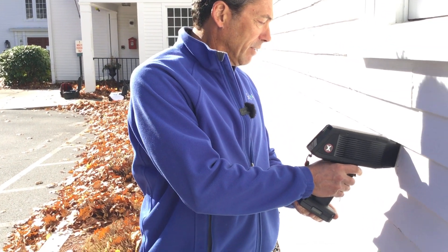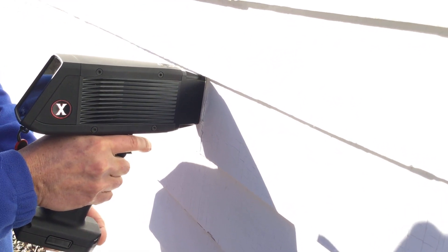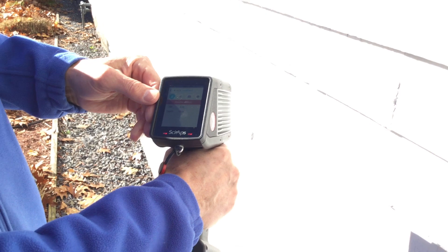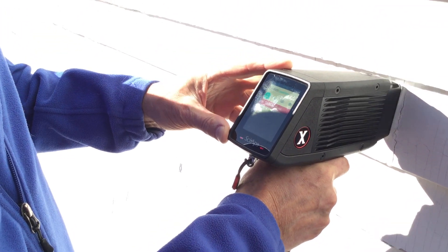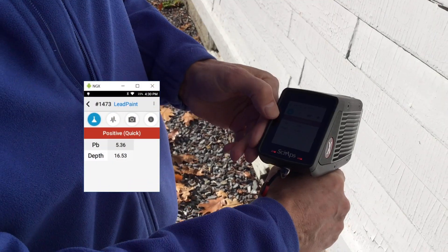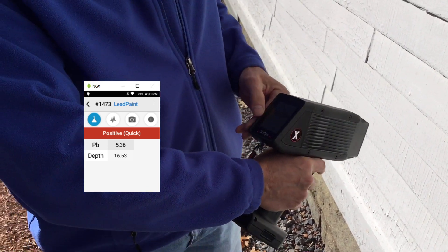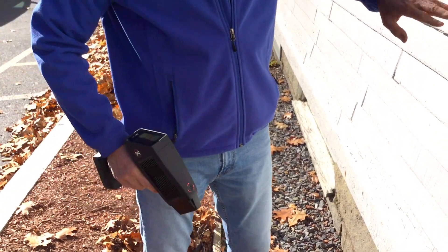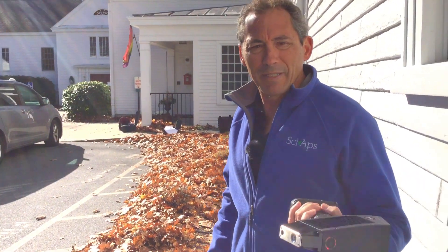Let's try this spot right here — we're going for the thickest possible paint. That was a very fast test — one second. Test 1473. It was very fast because the lead is up around five, but look at the depth — almost 17 depth factor. That's probably 75 to 100 layers of paint. Really thick paint, no problem with this reader, and we wouldn't expect any problems because it's got a great PCS.